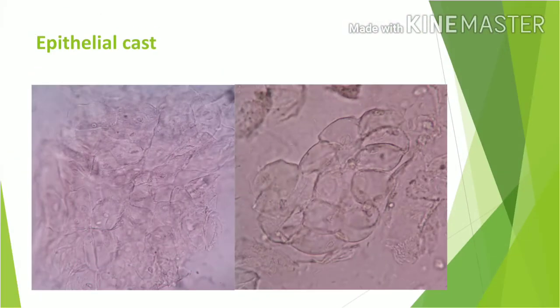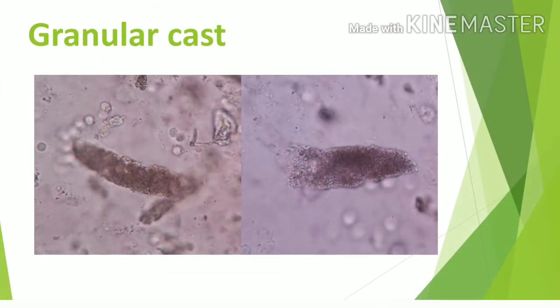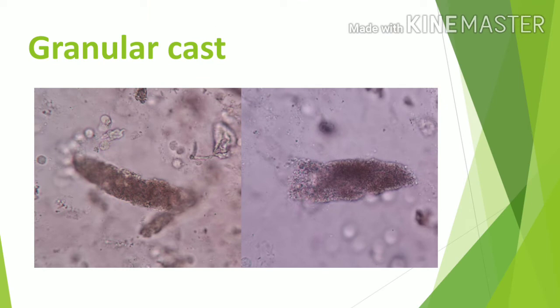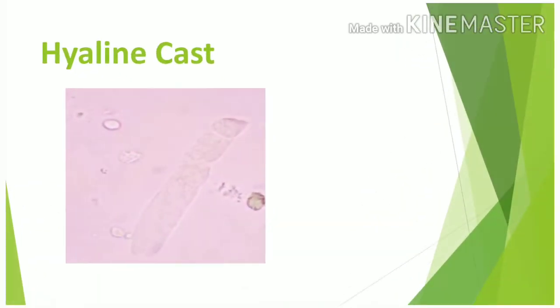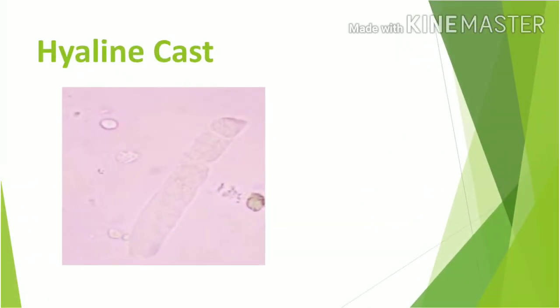A group of squamous epithelial cell clusters seen in this field. These two pictures show a single fine granular cast seen under the Microscope in high power field. It shows a single hyaline cast seen.